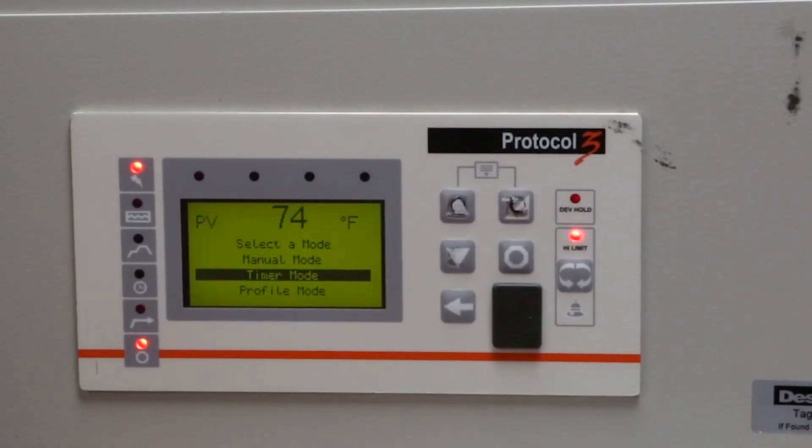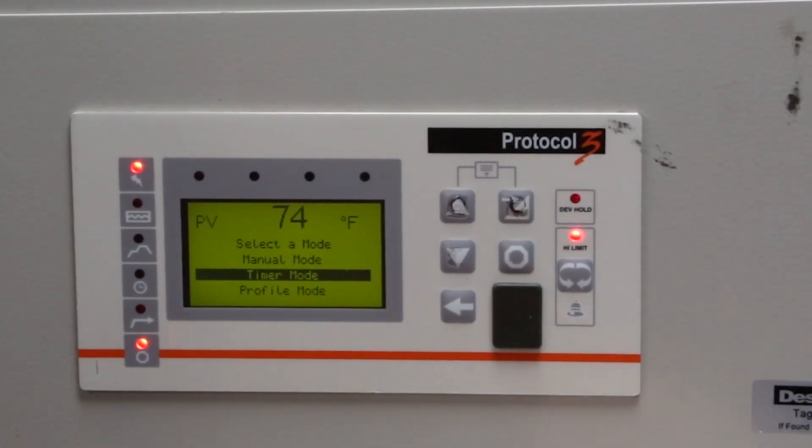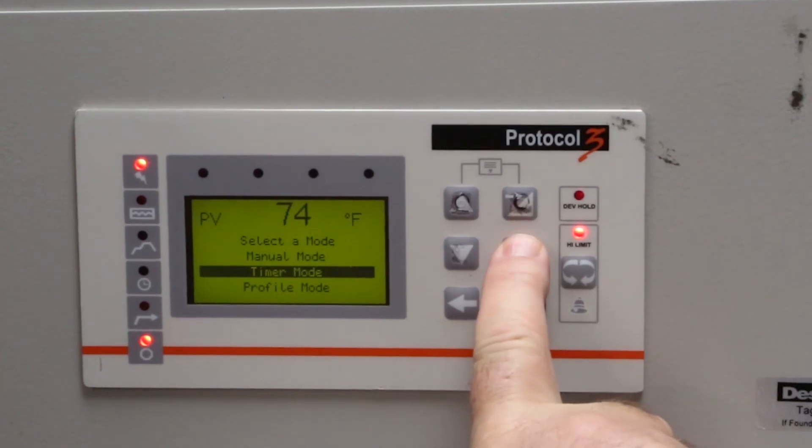First, confirm the oven is off. You can confirm that by the top and bottom light being illuminated. If the oven is not off, press the stop button.